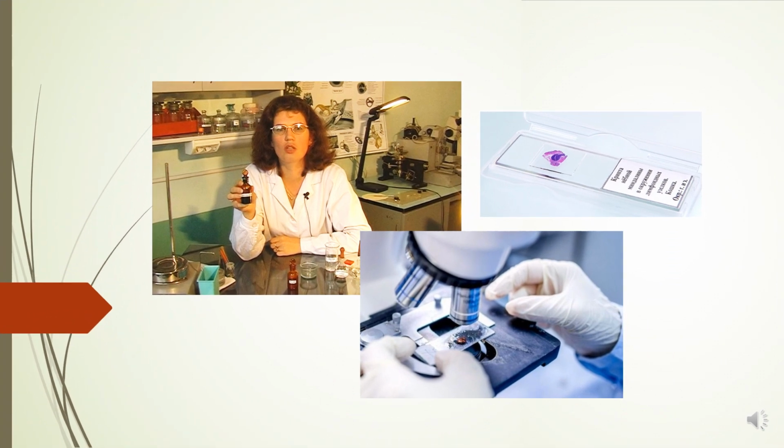Dear audience, the most common procedure used in histologic research is the preparation of tissue slices or sections that can be examined visually with transmitted light. To study samples of organs and tissues under a light microscope, they must undergo a special processing aimed at creating a high-quality histological specimen or preparation.